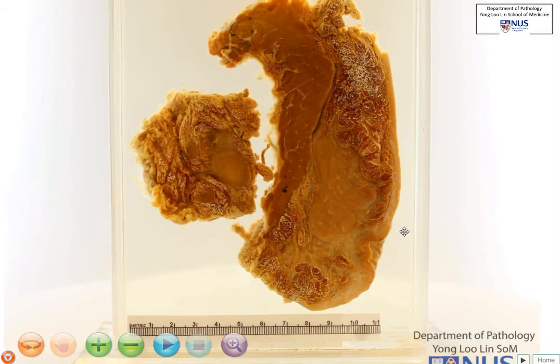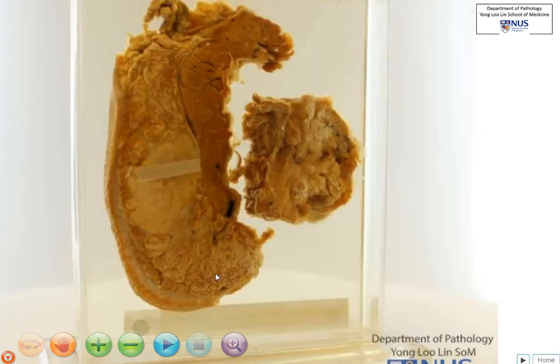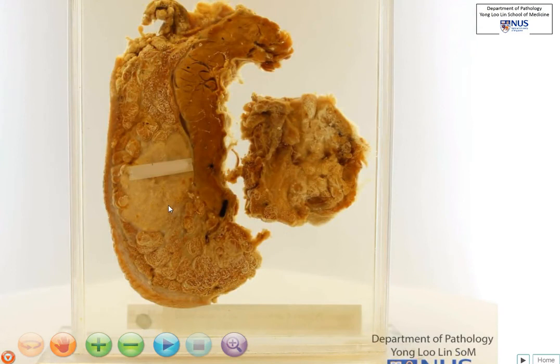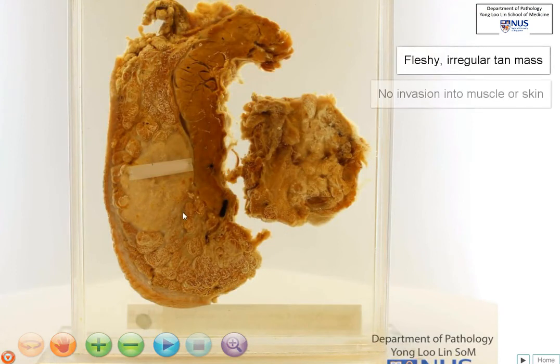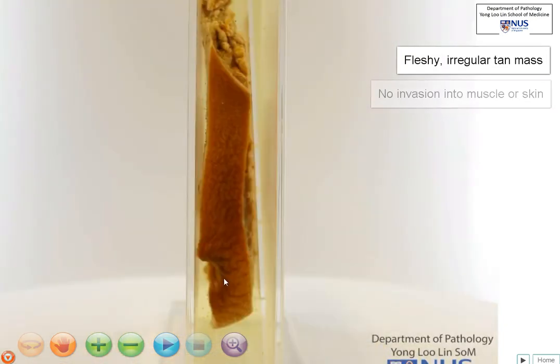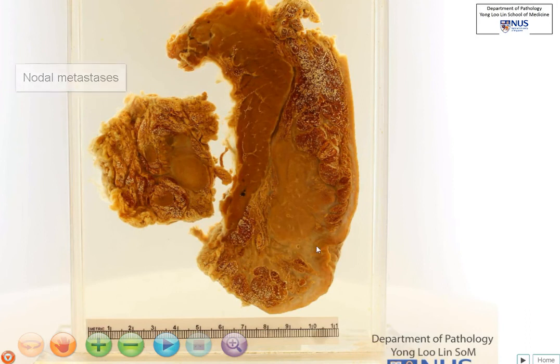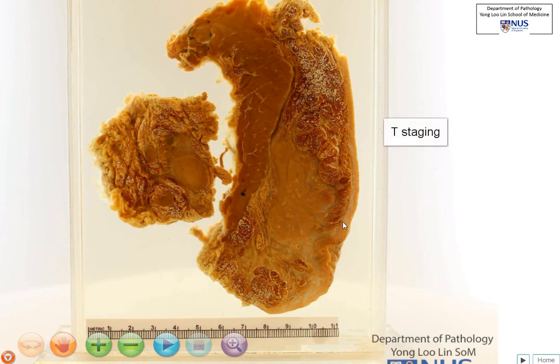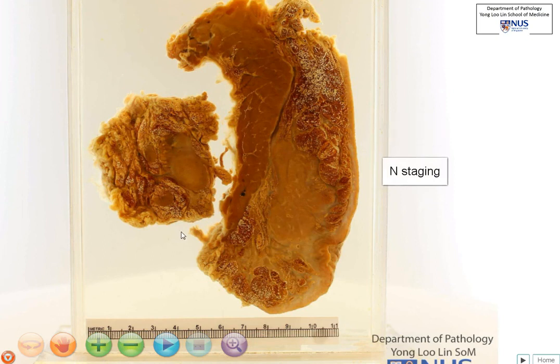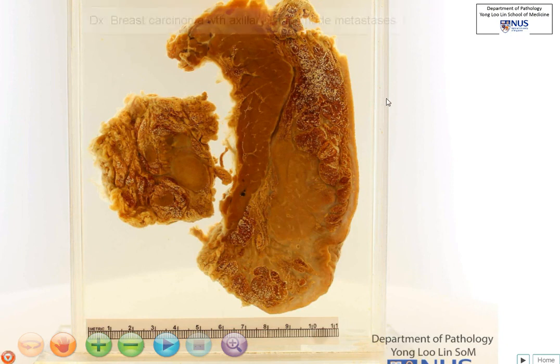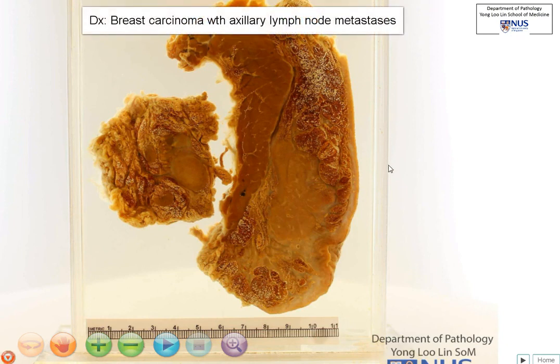So in summary, we have a fleshy, irregular, tan mass in the breast. This appears to be still confined within the breast parenchyma — it does not appear to be invading into the underlying pectoralis muscle or the overlying skin, although there is nipple retraction. In addition, we have metastatic carcinoma in the axillary lymph nodes. In this specimen we are able to perform the local T staging, confirming it with microscopy, and also the N staging once we examine all the axillary lymph nodes. So the diagnosis is breast carcinoma with axillary lymph node involvement.